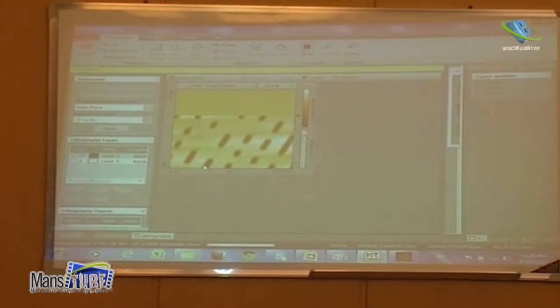You see how it's making scan? It's making point point. You see that it will take more time because you have different points. See this needle? There's no doubt. Now the expectation is like 3 minutes to finish this.